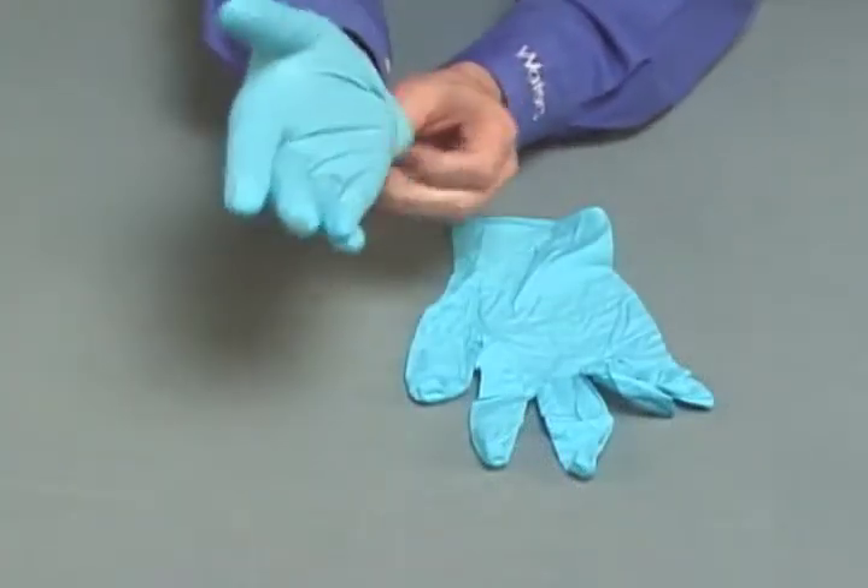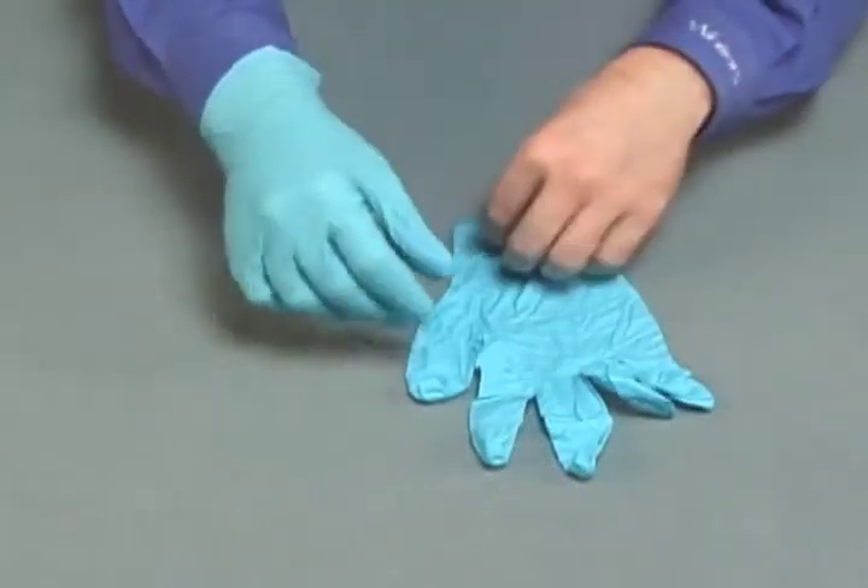Always wear clean, chemical-resistant powder-free gloves when performing this procedure.